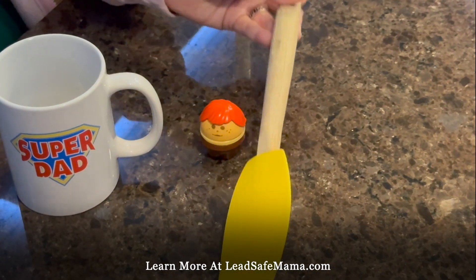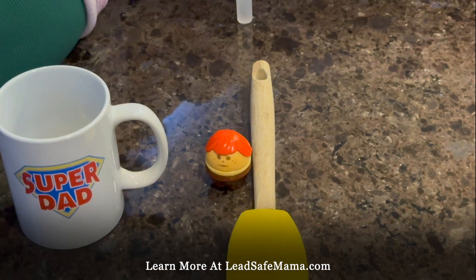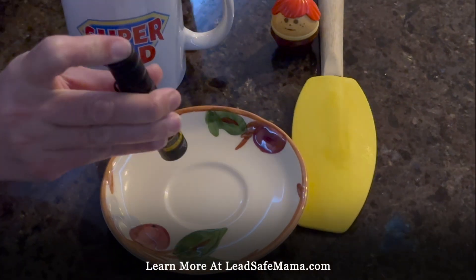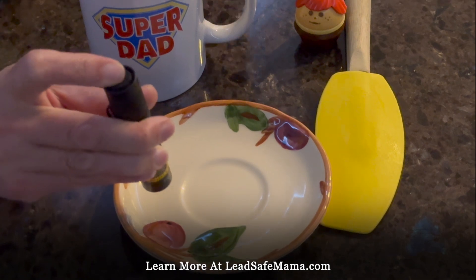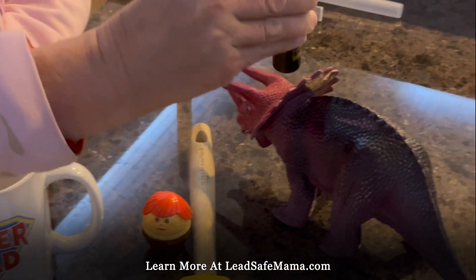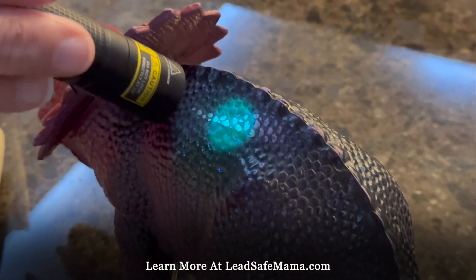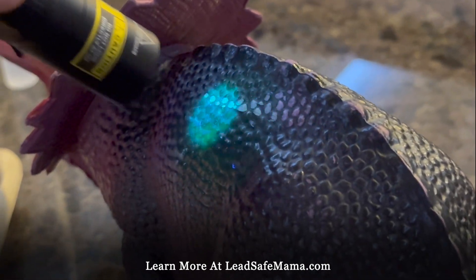This one didn't test positive with the reactive agent kit and it is leaded. There are different applications — like with paint, for example. Let's see if the glowing changed at all. This one only tested positive in a little tiny spot and it's really highly leaded. And this one is highly leaded and kind of tested positive — did test positive — but it's a little bit hard to see if you don't know what you're looking for. Can you see that green?